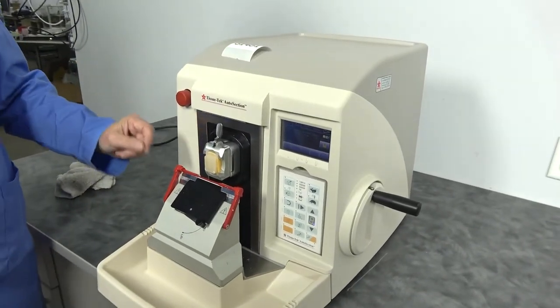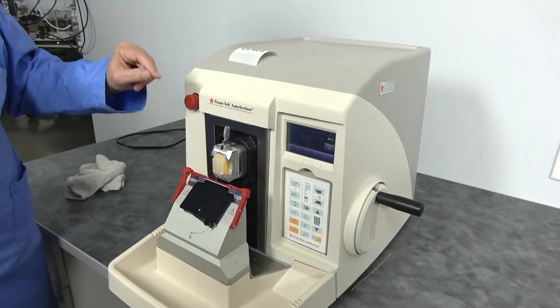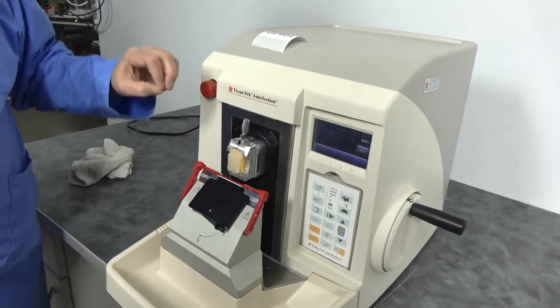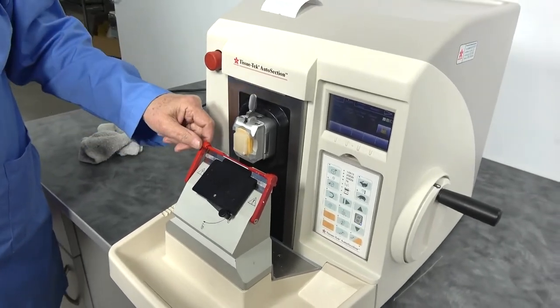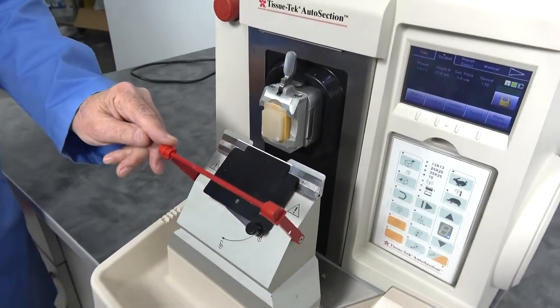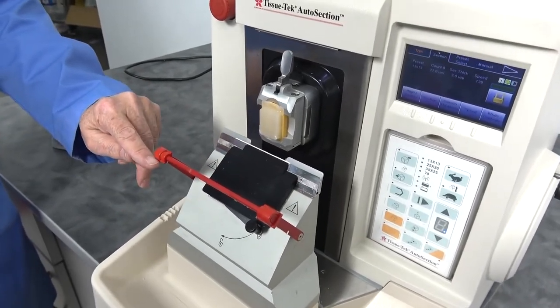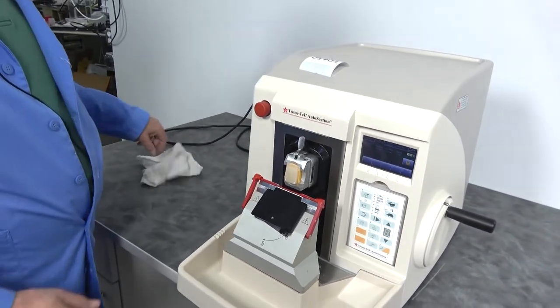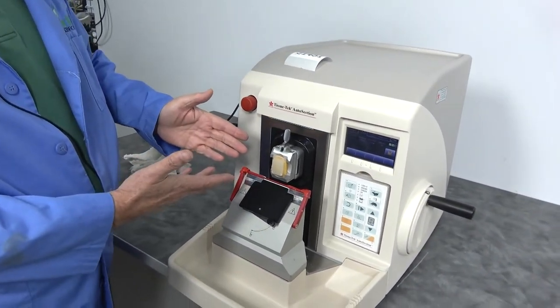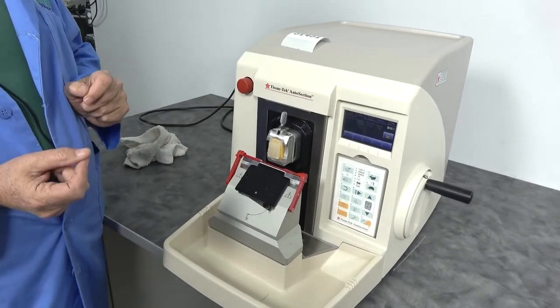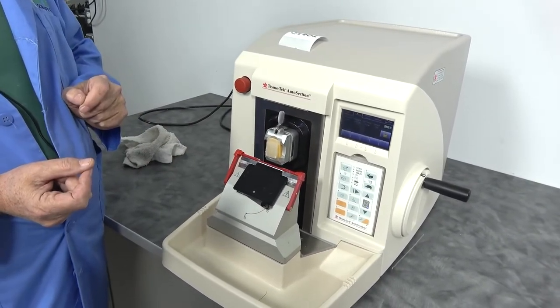Some of the nice features that we've seen is that you can go from mounting your block to sectioning in just moments. It is designed, we do have a blade in there, it is designed so it can be cut with the safety bar up so that you can be collecting your samples, your sections, with the bar in place to ensure that you don't get cut.